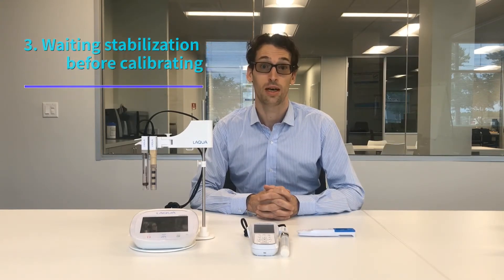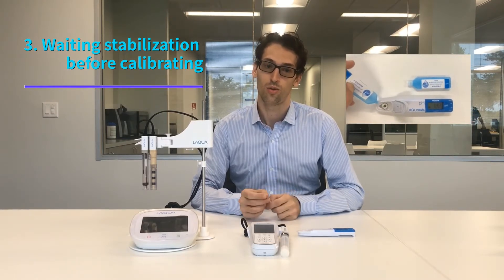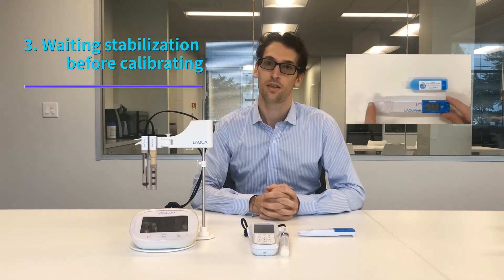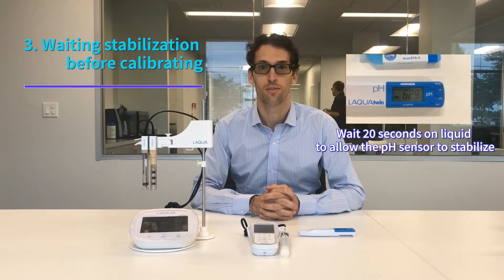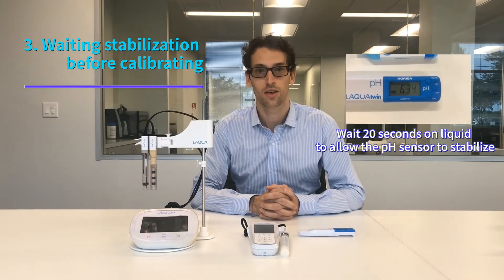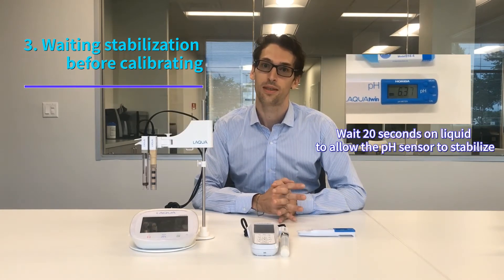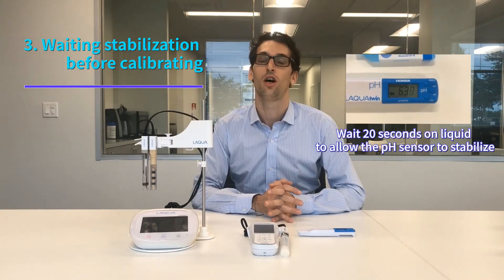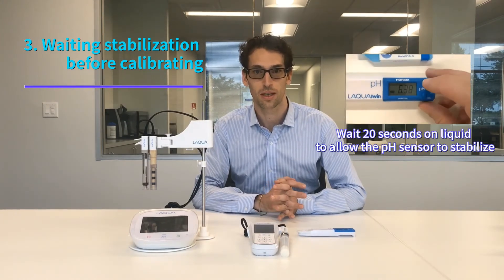The third thing you need to know is that it's important to await meter stabilization when you do the calibration. The right thing to do is to first put the pH standard solution on the sensor and wait about 20 seconds for the meter to stabilize. After stabilization you can go ahead and calibrate the meter. If you do it the other way around there is a risk of a calibration error, or your calibration will not be accurate because the meter will tend to calibrate too quickly.